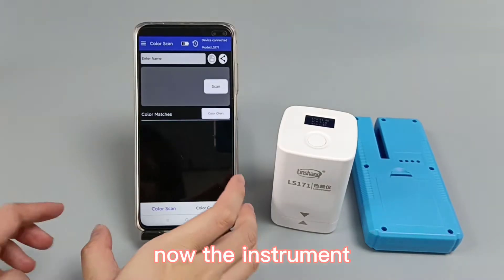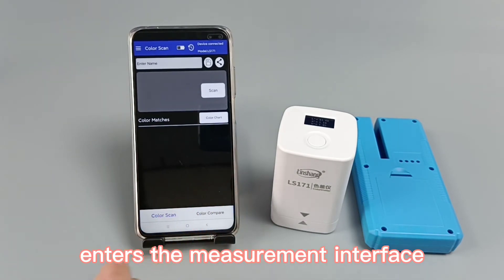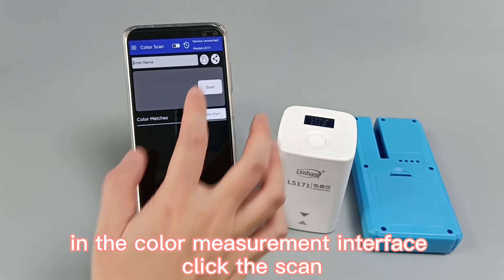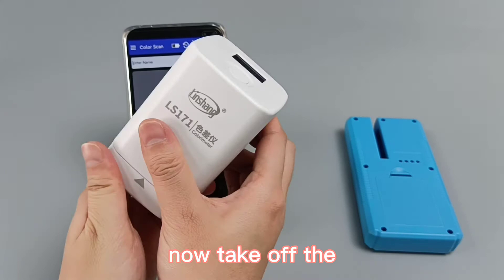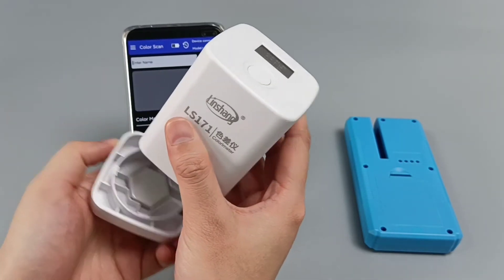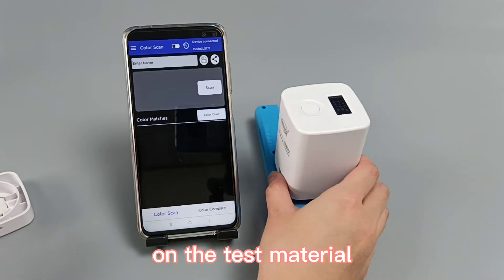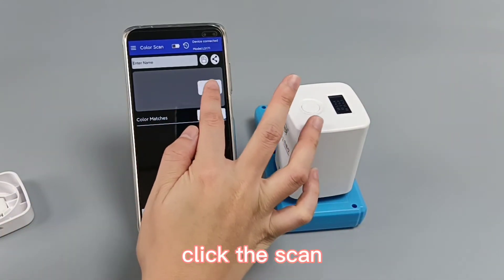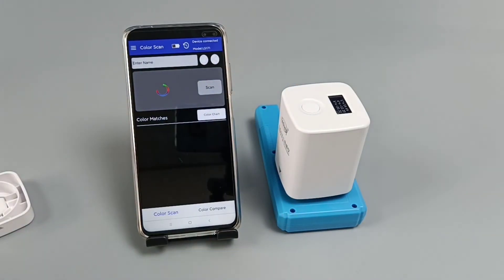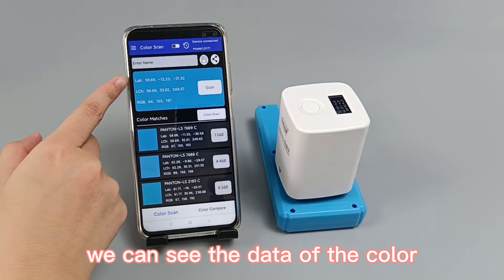Now the instrument enters the measurement interface. In the current measurement interface, click scan. Take off the calibration whiteboard and place the instrument on the test material, then click scan. We can see the color data.